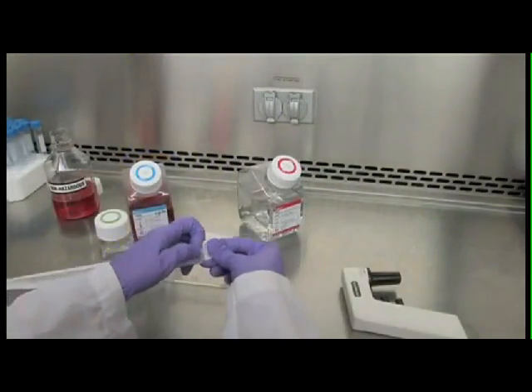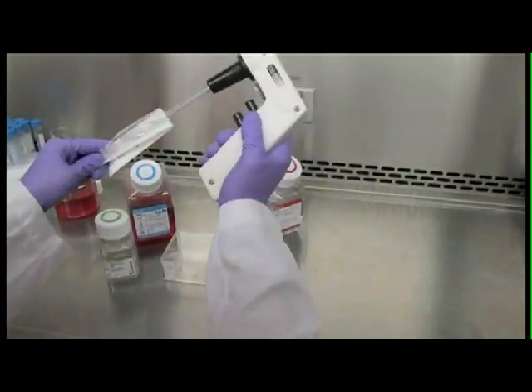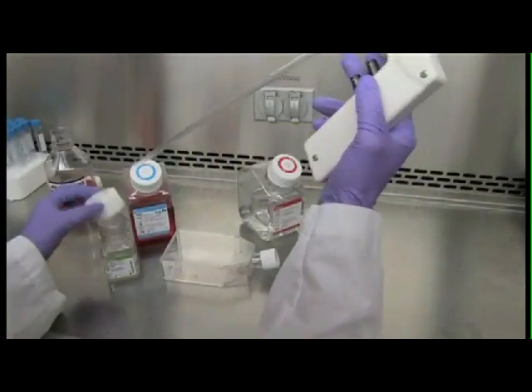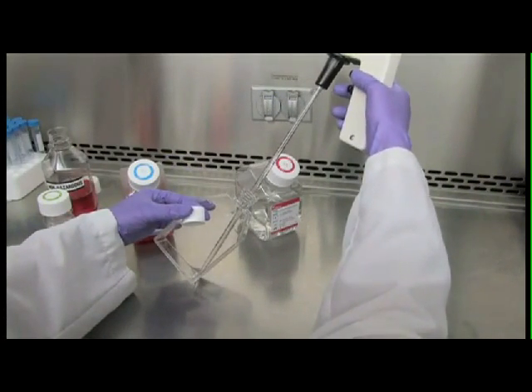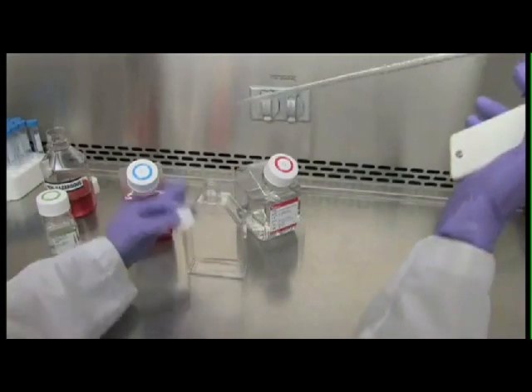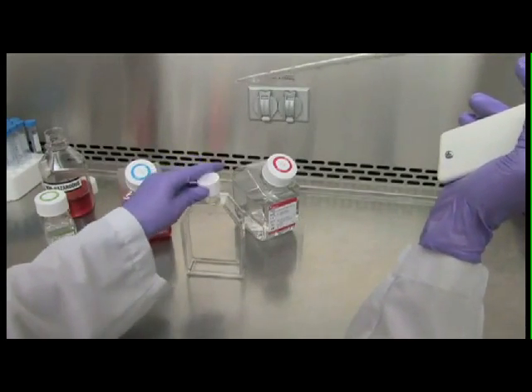Add your cell dissociation reagent to remove cells from the plate. Use just enough solution to cover the cell sheet. Consider using a gentle cell dissociation reagent, such as Triple Express, to avoid damaging your cells during dissociation.